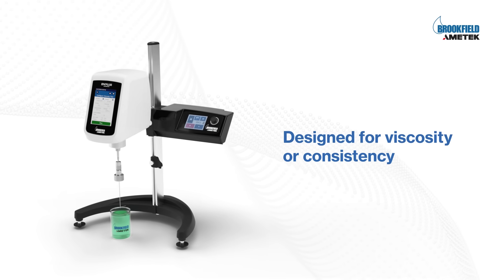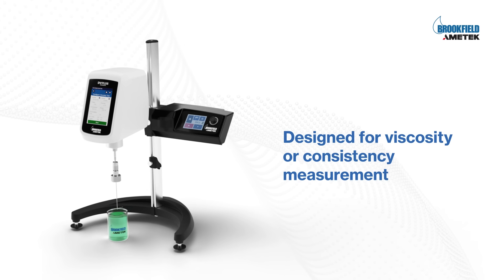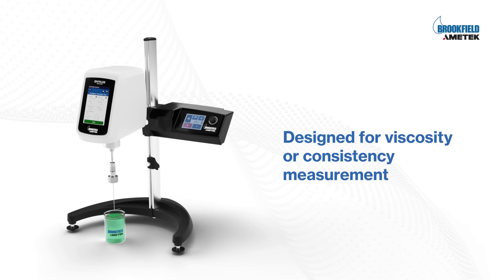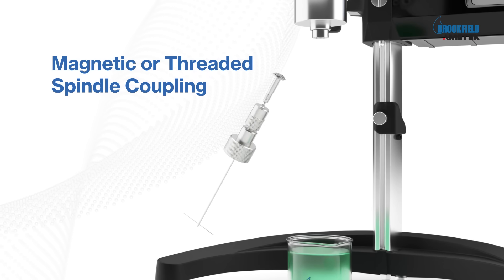Designed for viscosity or consistency measurement of materials that are sometimes difficult to measure, like gels, pastes, creams, putty, and other non-flowing substances. Available with a magnetic or threaded coupling option.